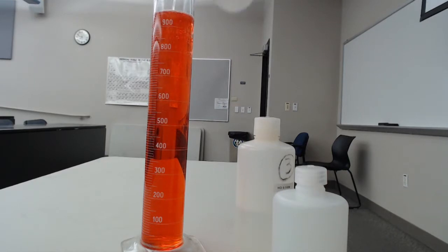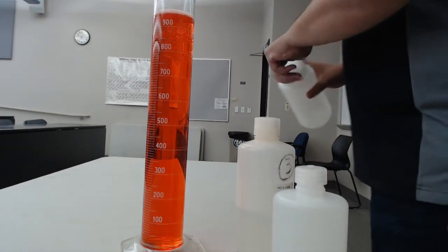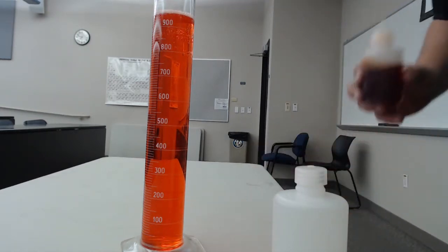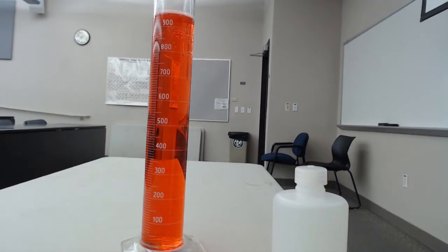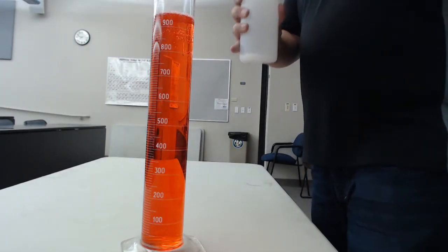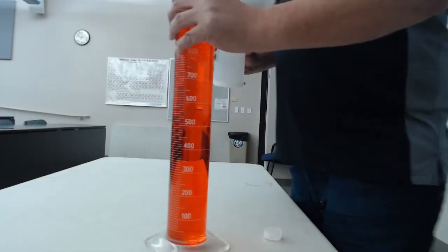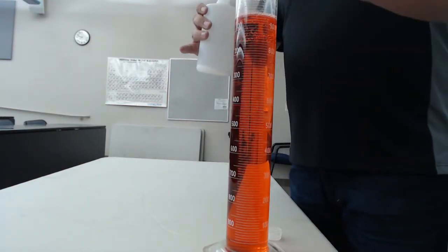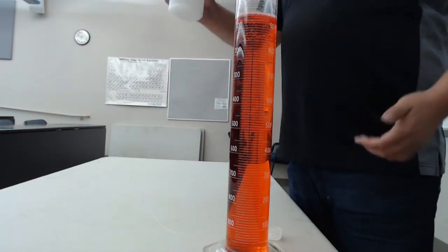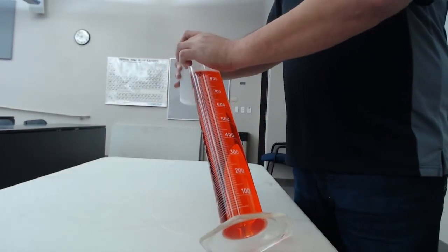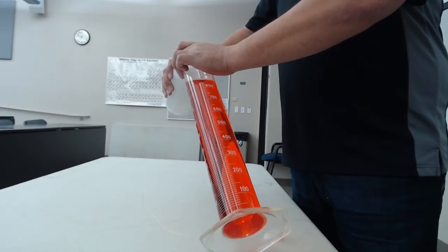And now the fun part. Notice here I'm not wearing gloves because I'm not afraid of these chemicals at all. I think the most thing I'm afraid of is getting this on my skin because it'll stain my skin for about an hour until I scrub it off with some bleach. All right, so let me go ahead and just carefully pour this in here. I want to angle this so when I pour it in there, since it's saturated, it'll fall to the bottom.